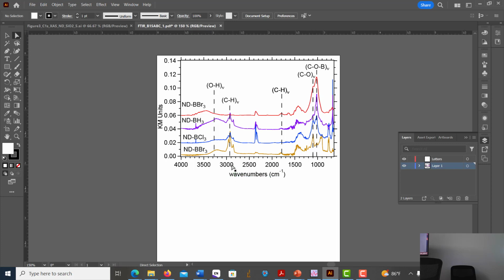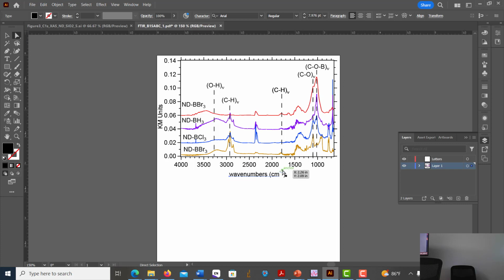So this is the cool thing. We're going to be able to select on anything here and be able to manipulate. That -1 is a little odd, and I'm not sure why it doesn't encode in a coherent way, but I've seen that multiple times where the superscript kind of gets messed up.